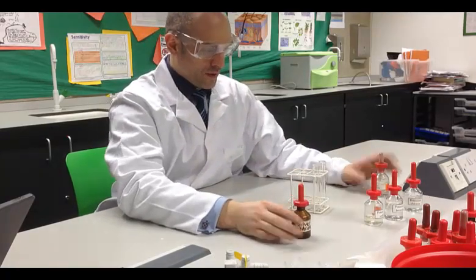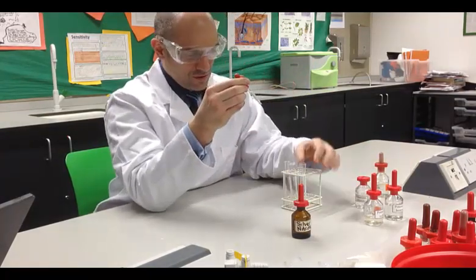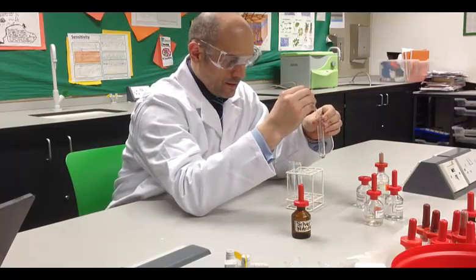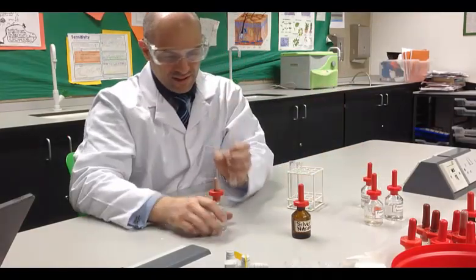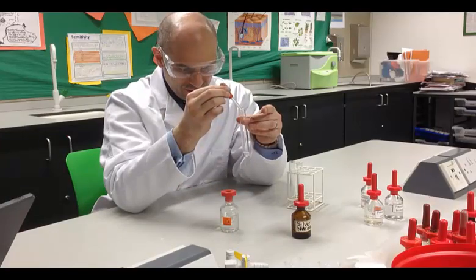So first up, let's do it with potassium chloride first. I'm going to add a few drops to a test tube. Okay, add some more so it's a little clearer. Then I will add nitric acid. You don't always need to add nitric acid, but I'm just adding it for completeness.